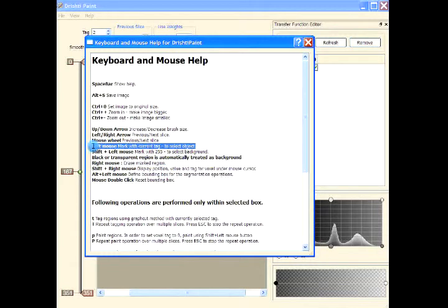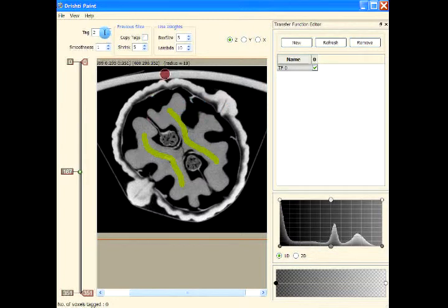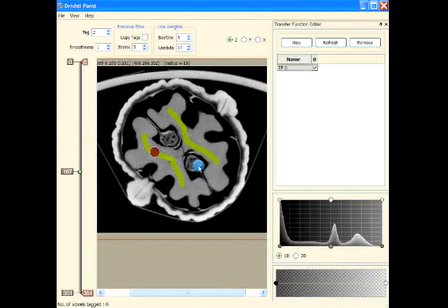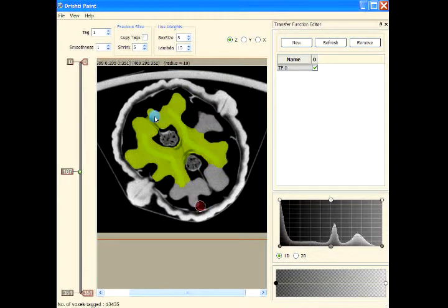If we press T now, the entire marked region gets tagged. Note: I was on Tag 2 but had marked the region for Tag 1. The program uses the current tag (Tag 2) when tagging, so since nothing was marked for Tag 2 nothing was tagged. I need to switch back to Tag 1 and then press T for the correct region to get tagged.